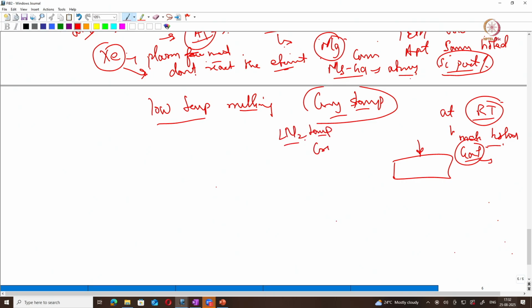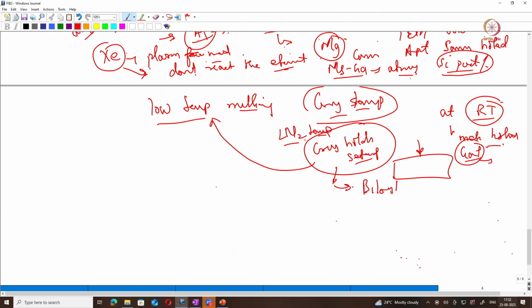There are certain cryo holders or cryo setups available now, which we can install and do low temperature milling to reduce or prevent gallium damage on the sample surface. Okay, and this cryo setup also gives an opportunity for these ion mills to be used for sectioning of biological samples or polymer samples.